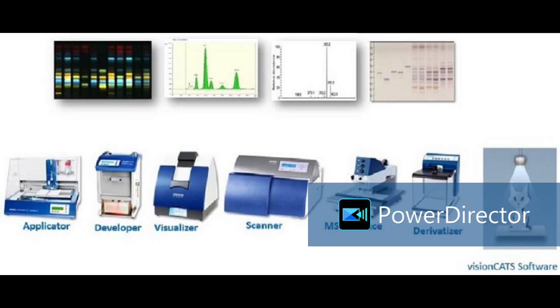Okay, so this is HPTLC fingerprint of this sample under UV light. This is fingerprint of same sample under fluorescent light. This is after derivatization under white light. This is after derivatization under fluorescent light. Okay, so एक ही sample के 1, 2, 3, 4 अलग-अलग fingerprint हमें मिल गए पूरे. Lot of information we are gathering in HPTLC. We are getting for unknown identification. It is very useful. So one fingerprint of one sample, other fingerprint of other sample, all together we can compare in comparison viewer option.